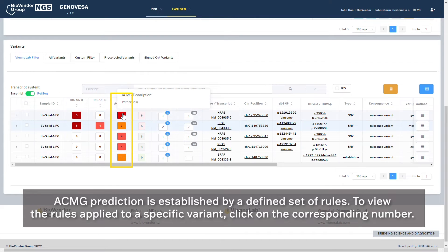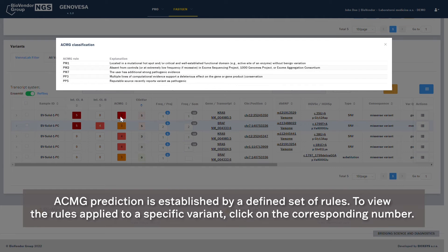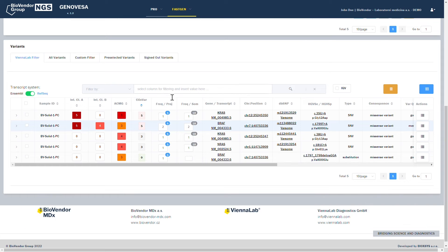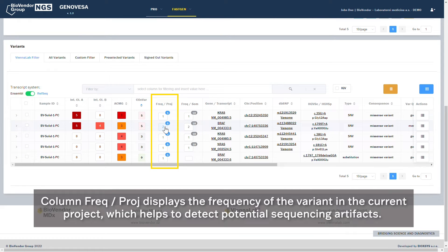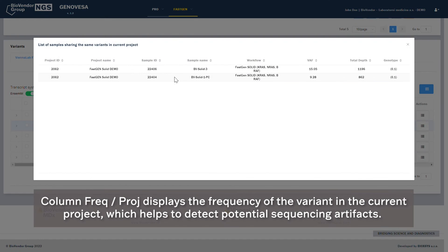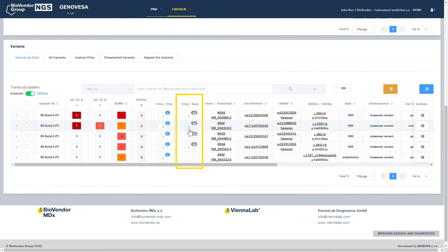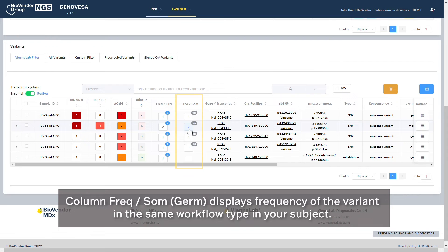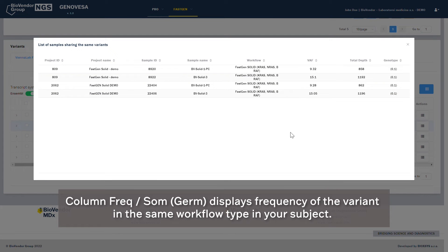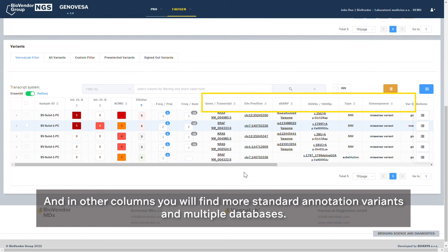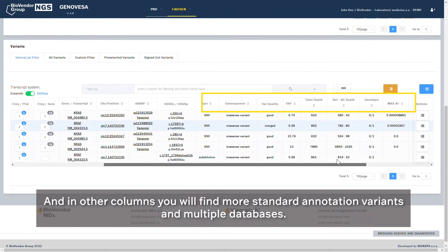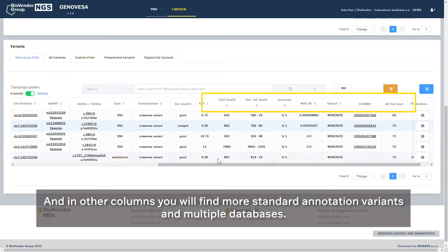ACMG prediction is established by a defined set of rules. To view the rules applied to a specific variant, click on the corresponding number. Column Freq / Proj displays the frequency of the variant in the current project, which helps to detect potential sequencing artifacts. Column Freq / Som (Germ) displays the frequency of the variant in the same workflow type in your subject. In other columns, you will find more standard annotation variants and multiple databases.